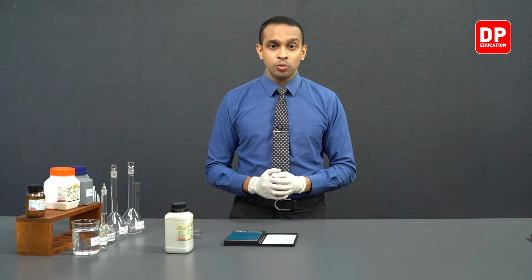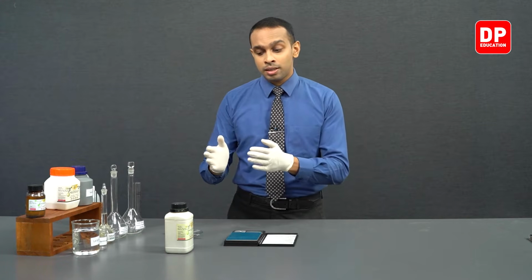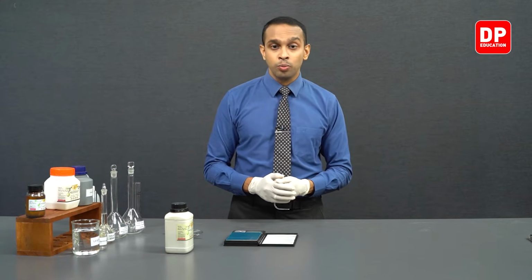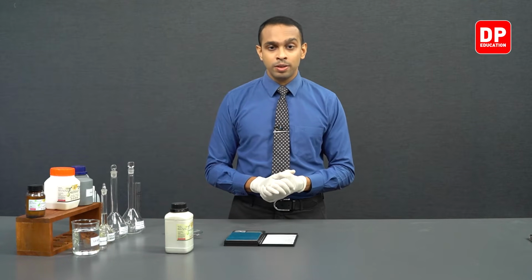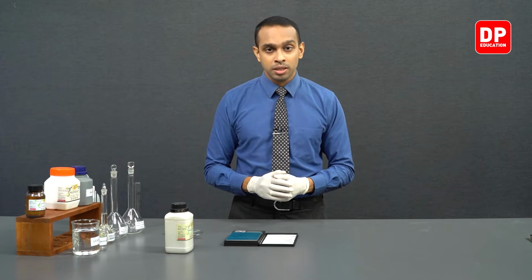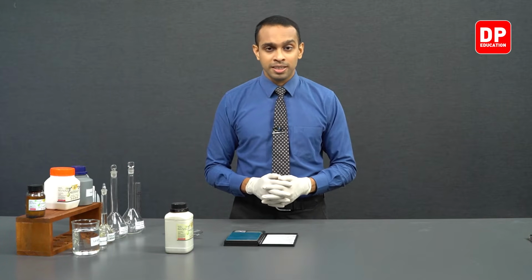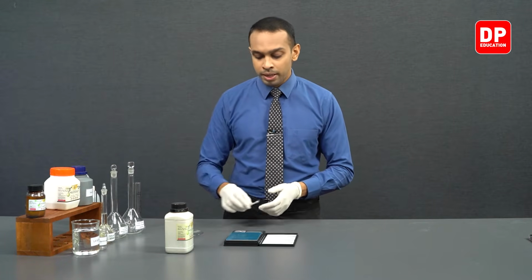When you do the calculation, you would observe the number of moles we need is 0.025 moles, and given that the molar mass is 482.19 grams per mole, the mass we should measure is 12.05 grams to prepare 0.1 moles per decimeter cubed concentrated ammonium ferric sulfate solution. So let's move on to measuring that mass.